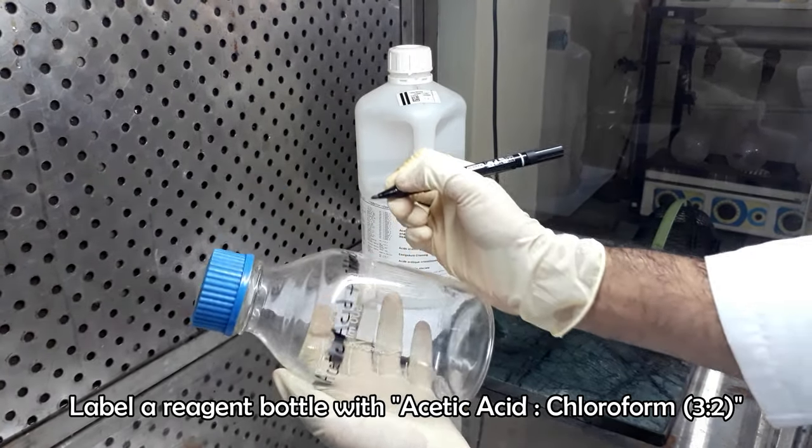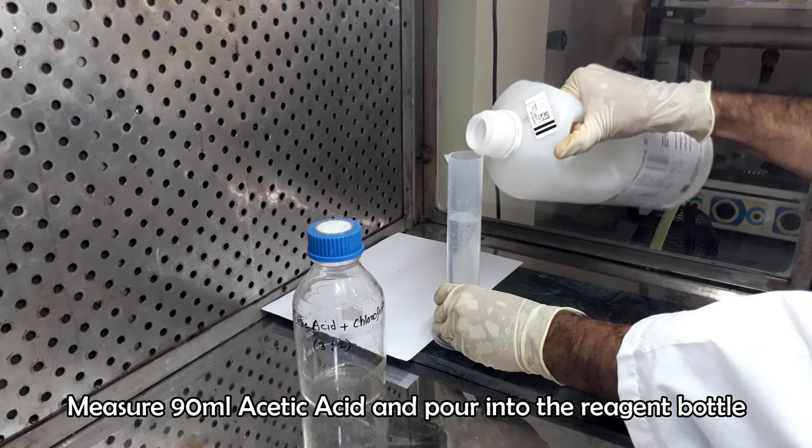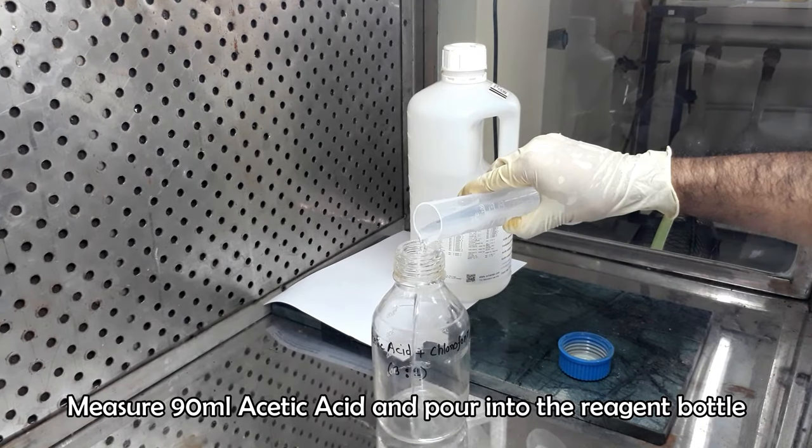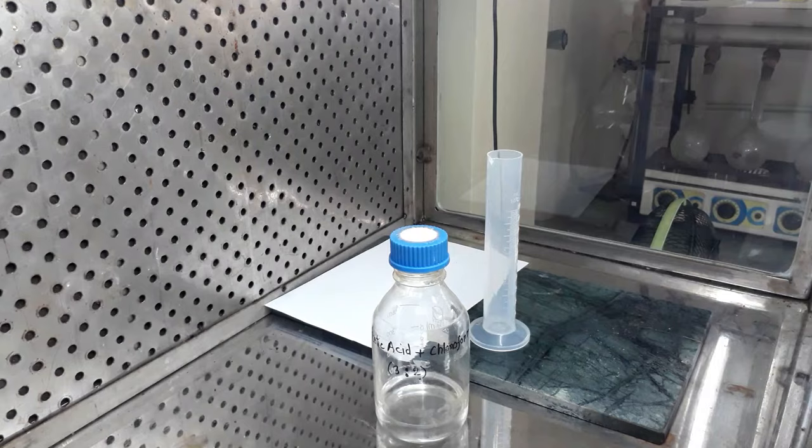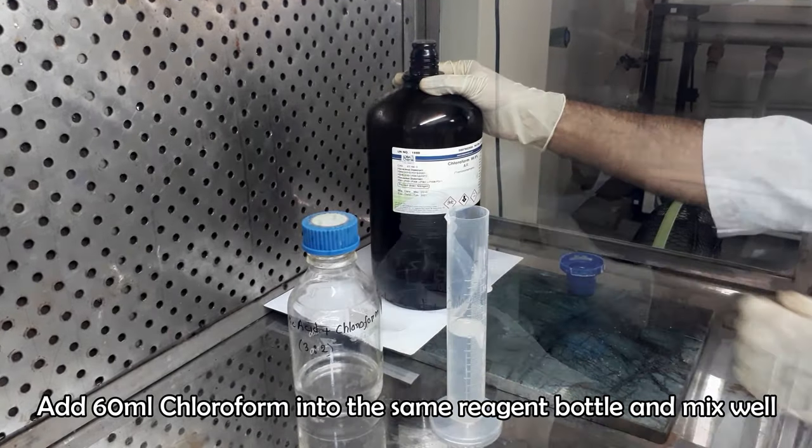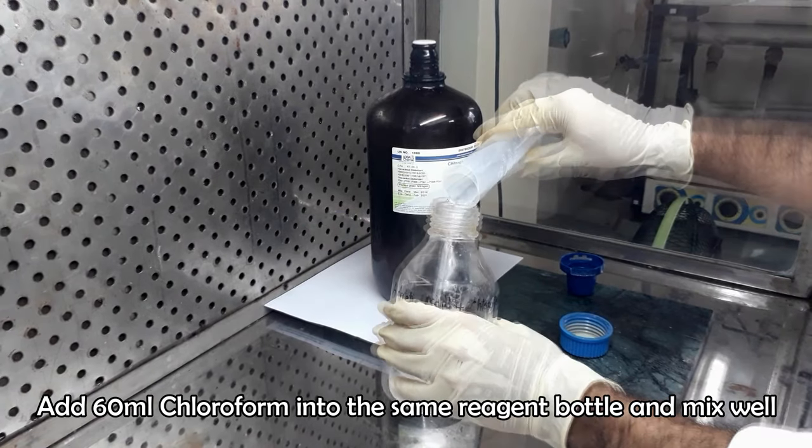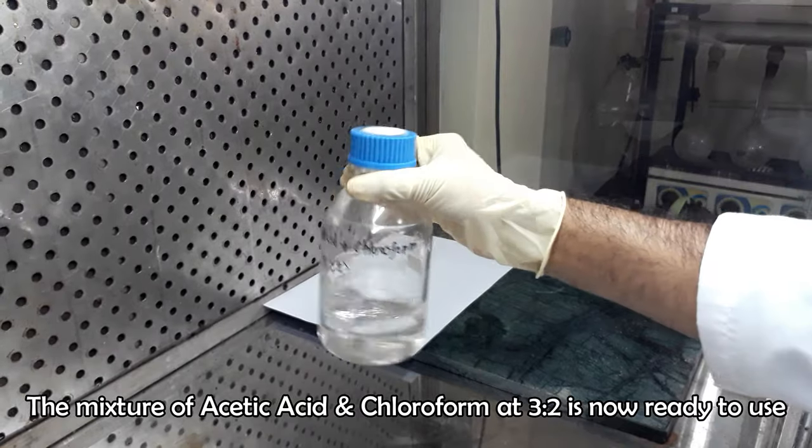Acetic acid and chloroform should be mixed in ratio of 3 to 2. Measure 90 ml of concentrated acetic acid and take it in the pre-labeled reagent bottle. Now measure 60 ml chloroform and pour into the same reagent bottle. Shake the bottle to mix the chemicals.